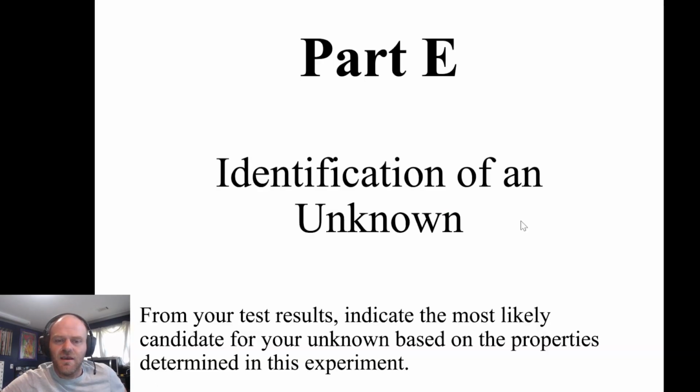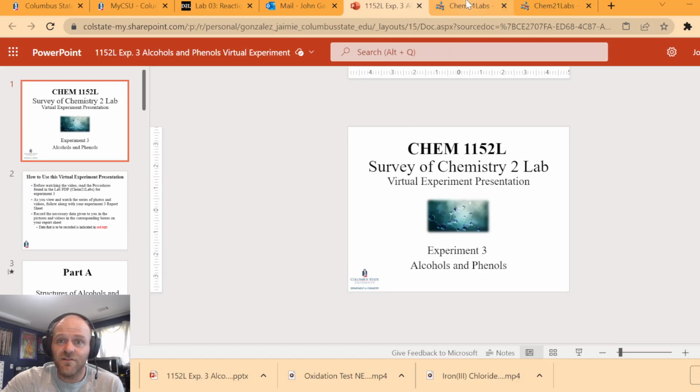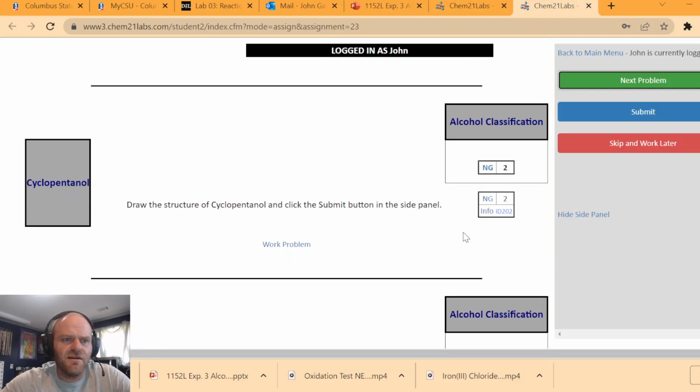So for part E, you just record all of the information that you found out about your unknown, and tell me which one of the 5 things tested here today the unknown is. You will tell me which one you think it is, and that's pretty much it for the lab report. Let me just kind of double check.